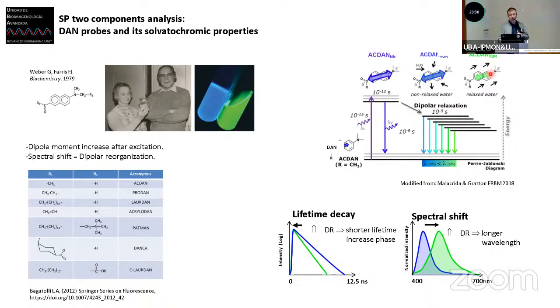And while these water molecules are reorganized, part of the energy is spent in this reorganization. And finally, the fluorescence will be modified because it shifts to lower energy, which is greener fluorescence. And this is true for spectra, but it's also true for lifetime. It changes the lifetime too, right?